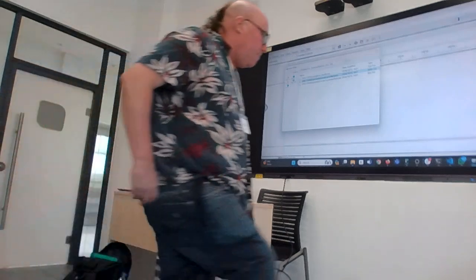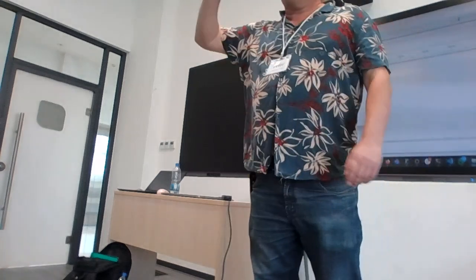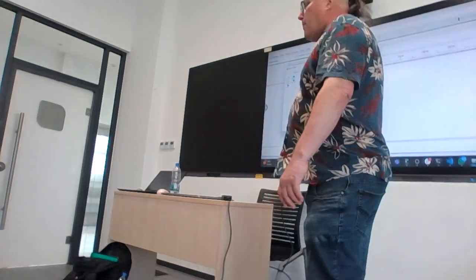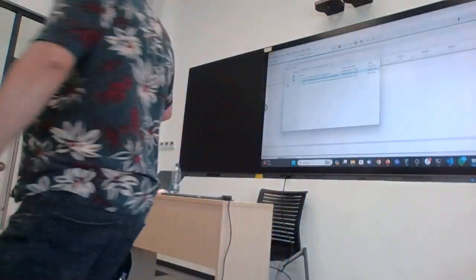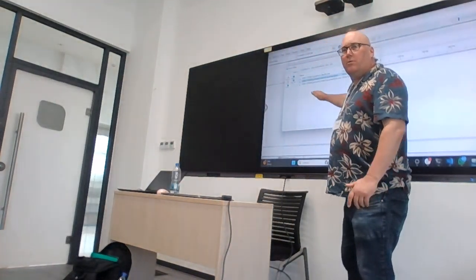I have BAM and BAI, the two things that go together. BAI is the index for the BAM, okay? But I want to open the BAM file for my sample. If you have more than one sample, you will have more than one BAM file in this folder. Okay?